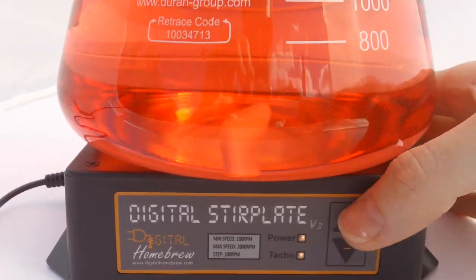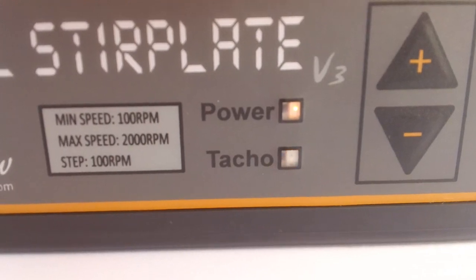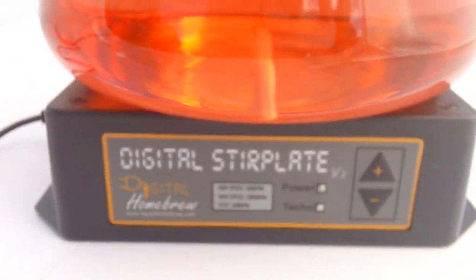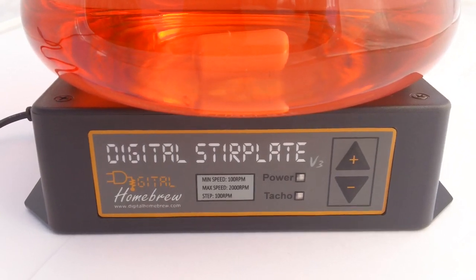It also makes little beeping noises as you can hear, and it's got a tacho LED — you might not be able to see that light flashing in the daytime here as we're outdoors filming. Anyway, if you want to hear more about the digital stir plate, head over to www.digitalhomebrew.com and you'll find all the information you need there.